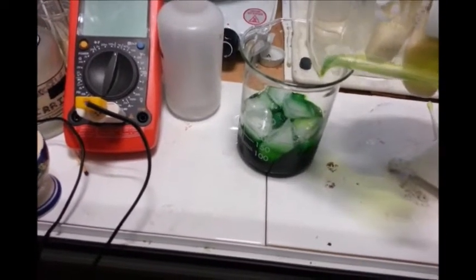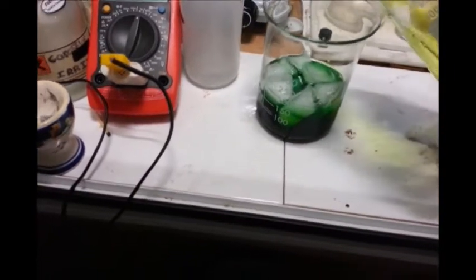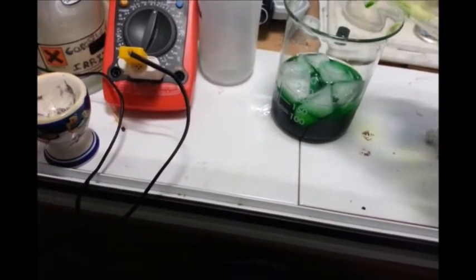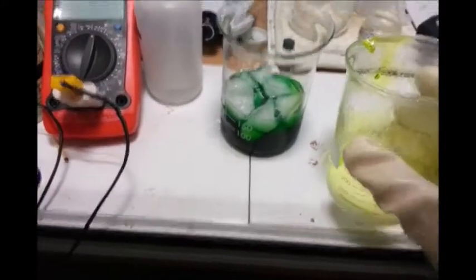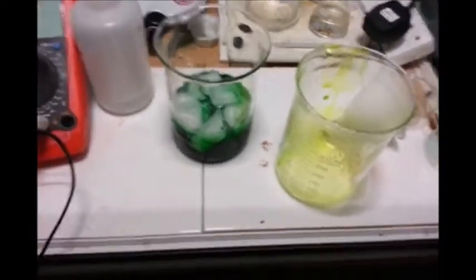So just pour it onto the ice cubes like that. Very nice emerald pool. Just going to rinse that out, and then let that cool and the ice melt, and then we'll be ready to filter.